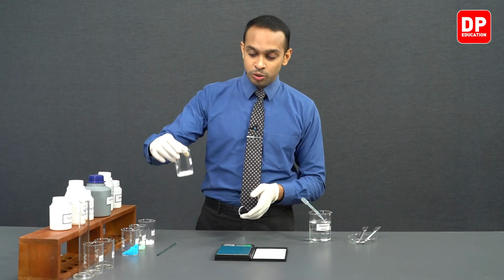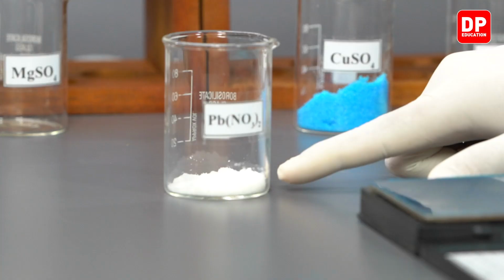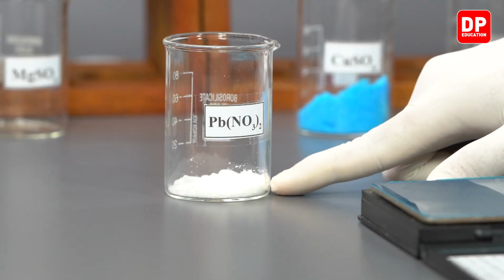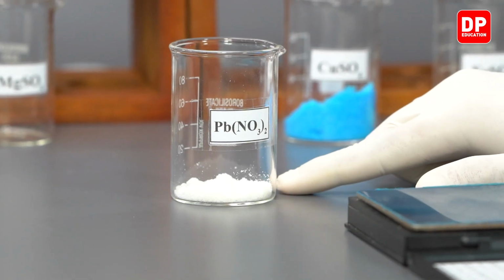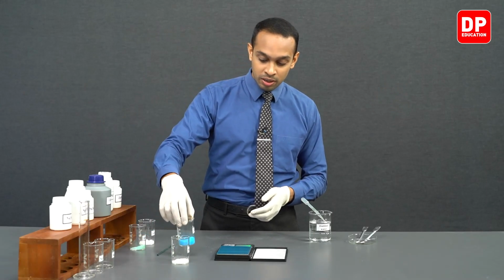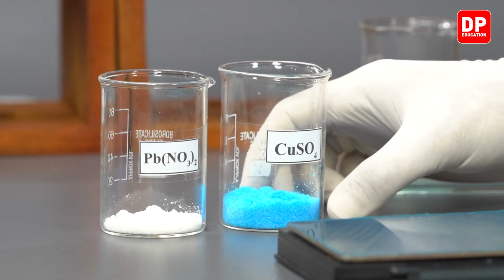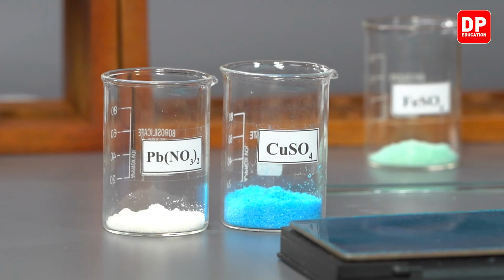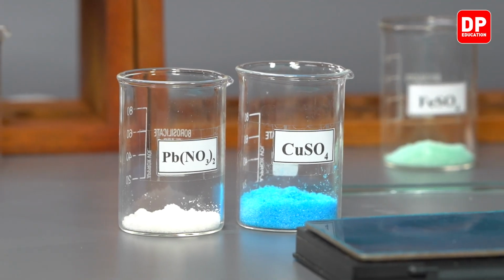And another observation you can make is the fact that 16.6 grams of lead nitrate is only going to fill up our beaker. Only the bottom is barely covered. But when it comes to 16.9 grams of copper sulfate, you can observe how much more copper sulfate we had to take to reach a similar mass, right?